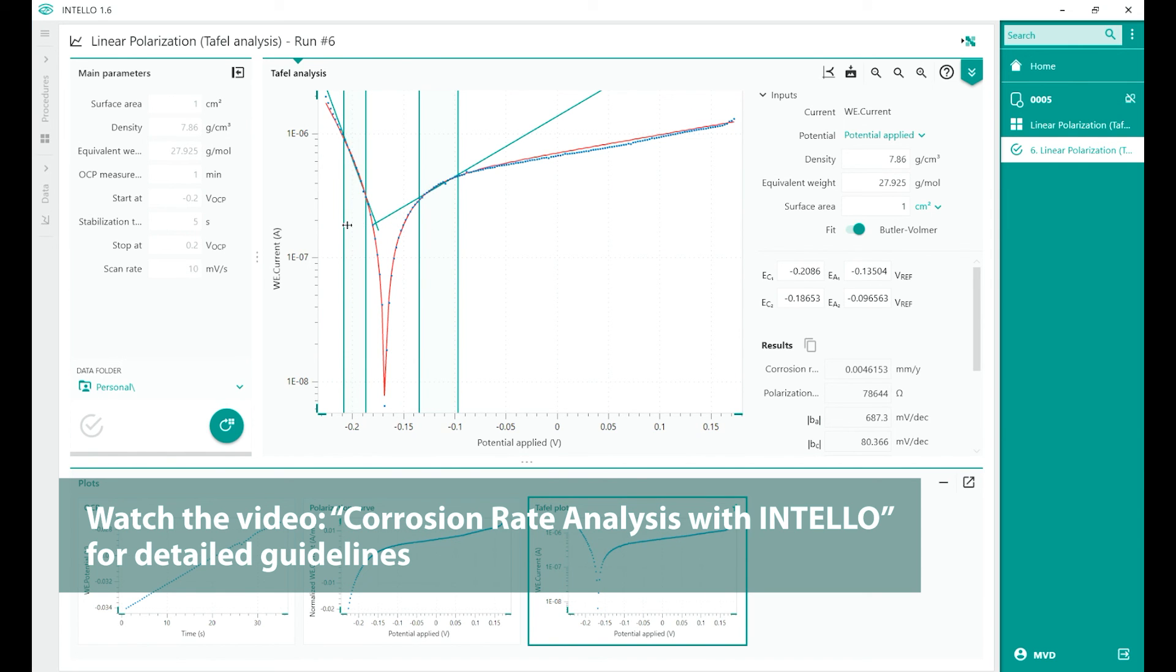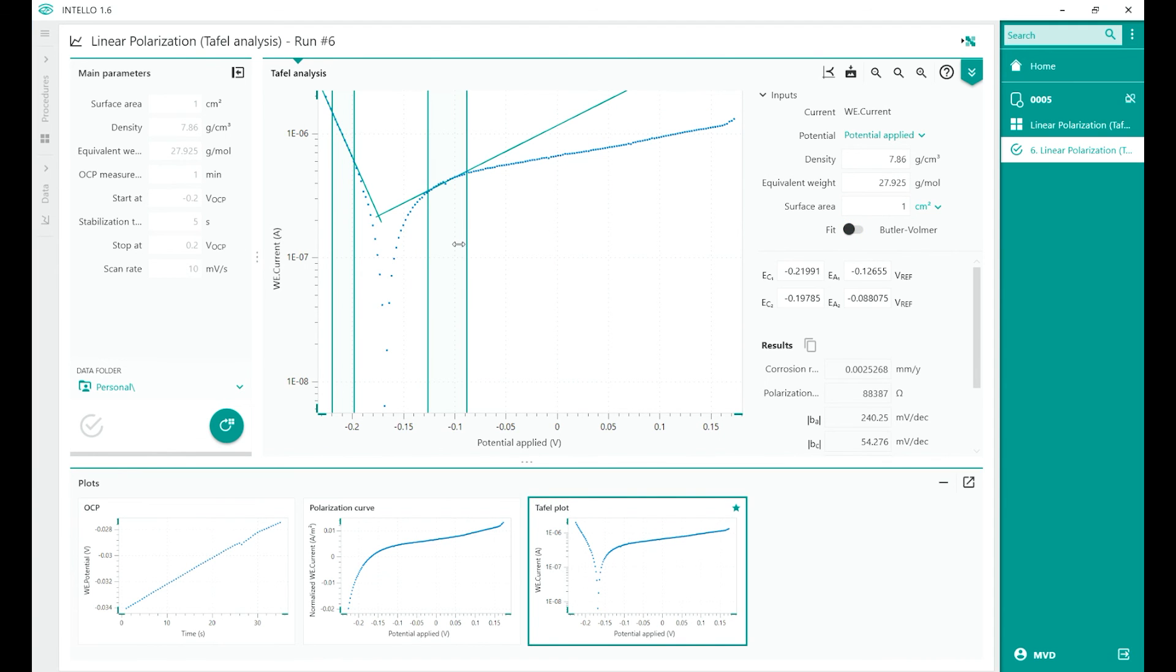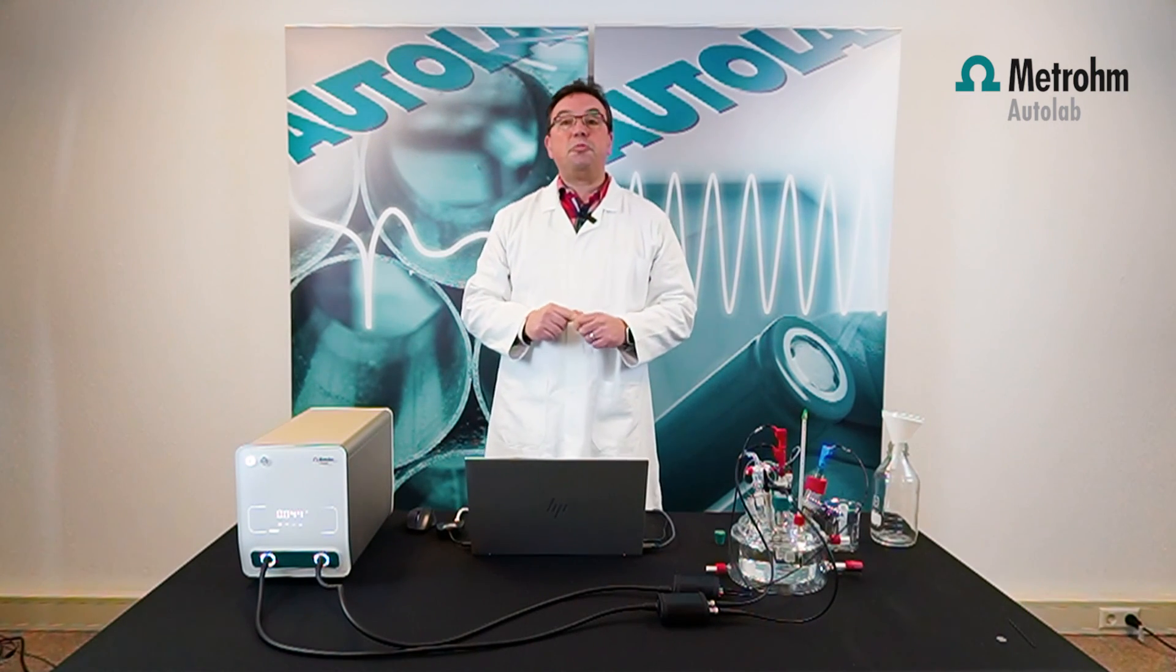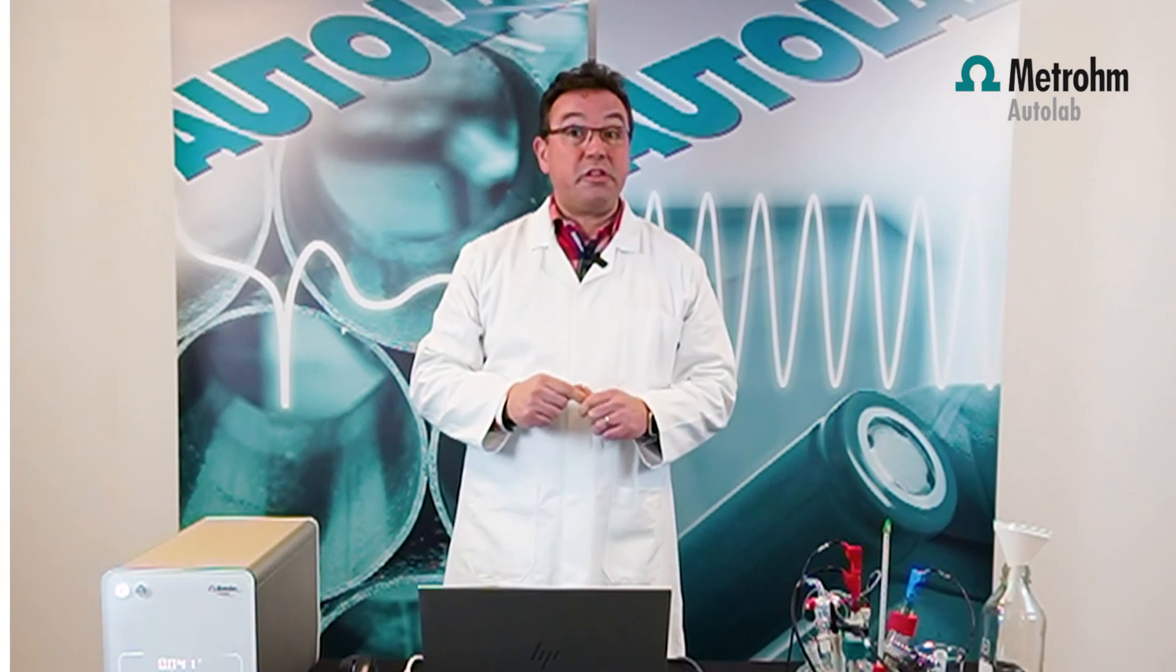You can move or increase it if needed. You can also move the complete setting with these two markers. You will find a detailed video on our Metrohm Autolab YouTube channel that will take you through the procedure step by step. Thank you for your attention.